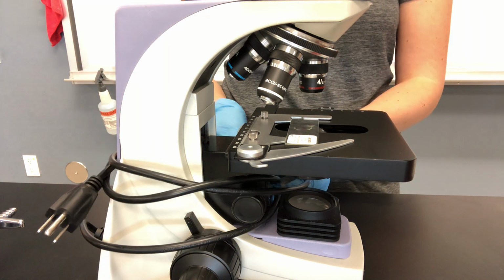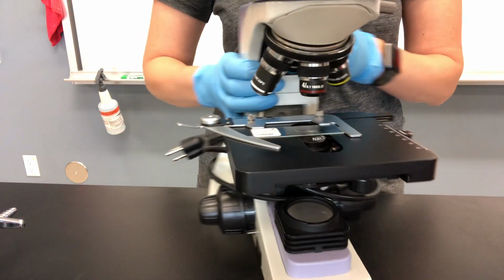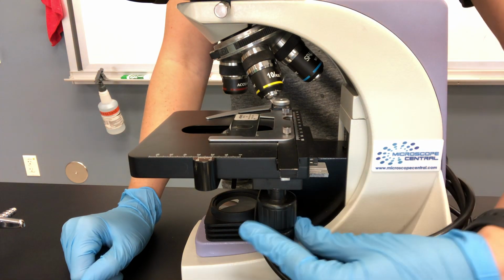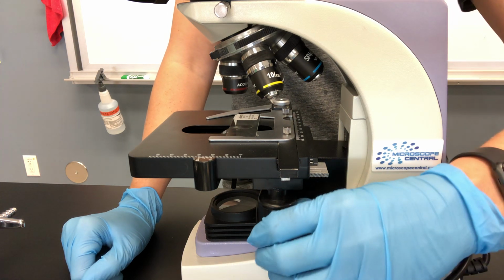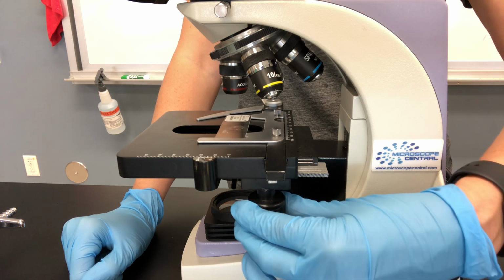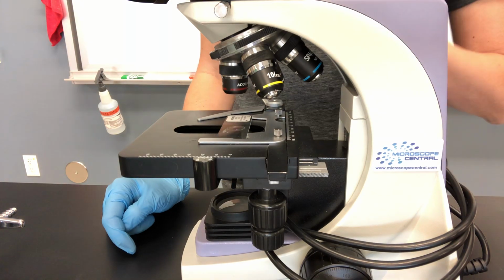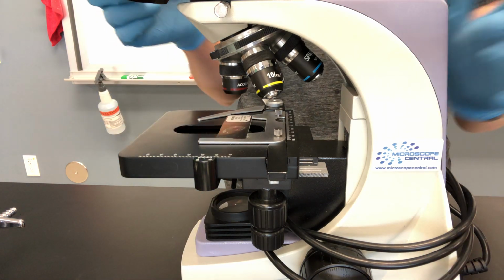Now, I'm not going to plug this in because I'm just using this as a demonstration. I'll turn it around here so you can see all the parts. But you'd plug it in to turn it on. So on this side of the stage, you can see these dials. I'm going to call them stage dials. You use those to move the specimen until the stained specimen is right over the light that's coming through here.